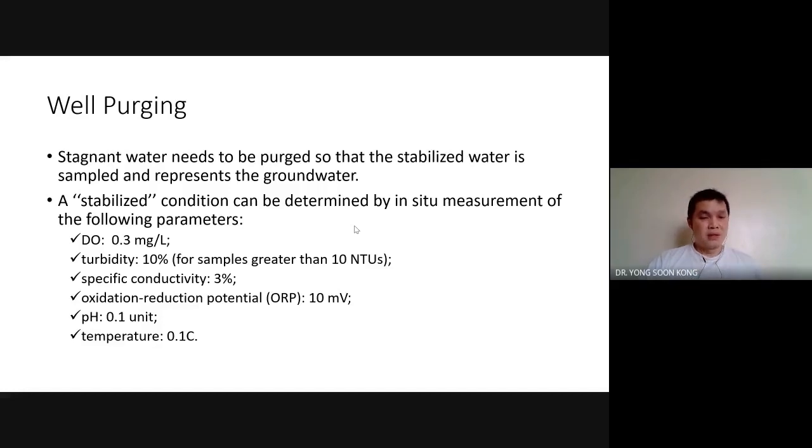Okay. So, if you look at these parameters, what are the things that we usually see? Number one, if not mistaken, is pH. pH is always number one. And number two is electrical conductivity. Now, the main reason why we determine this is it is so easy to determine. You can have a pH meter coupled with electrical conductivity, dip it in straight away, you know it. So these are the parameters that are measured right away, just like when we sample surface water, because we can. No need to bring back to lab. You can do it right away.